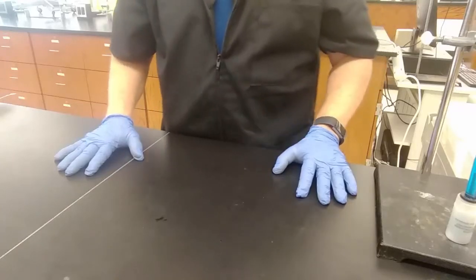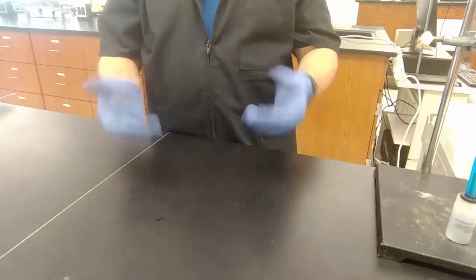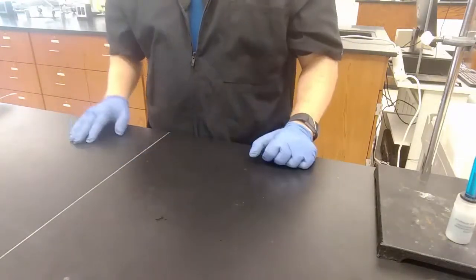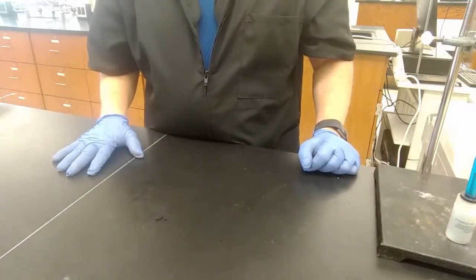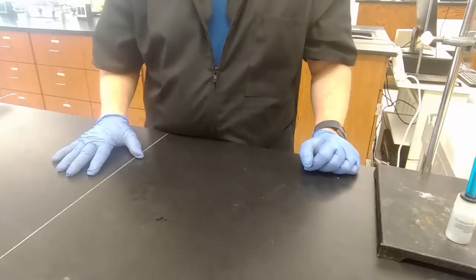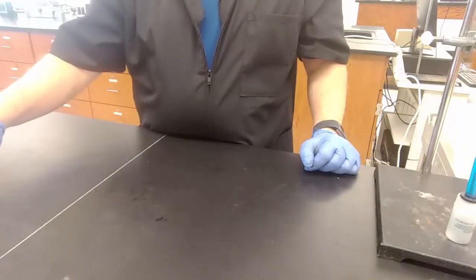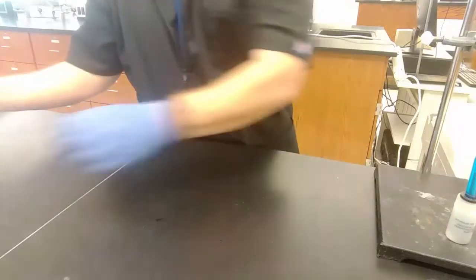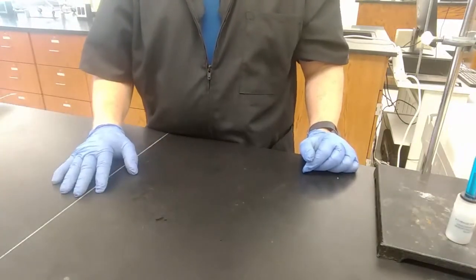Experiment 12, determination of solution pH. I, as always, have my goggles and gloves and a lab coat on for safety, and am following the procedure detailed in the lab manual. So we're doing another serial dilution, just like we did in the spectrophotometry lab, where we diluted that blue copper sulfate solution. This week we are diluting various acid and base solutions to get different concentrations of those.